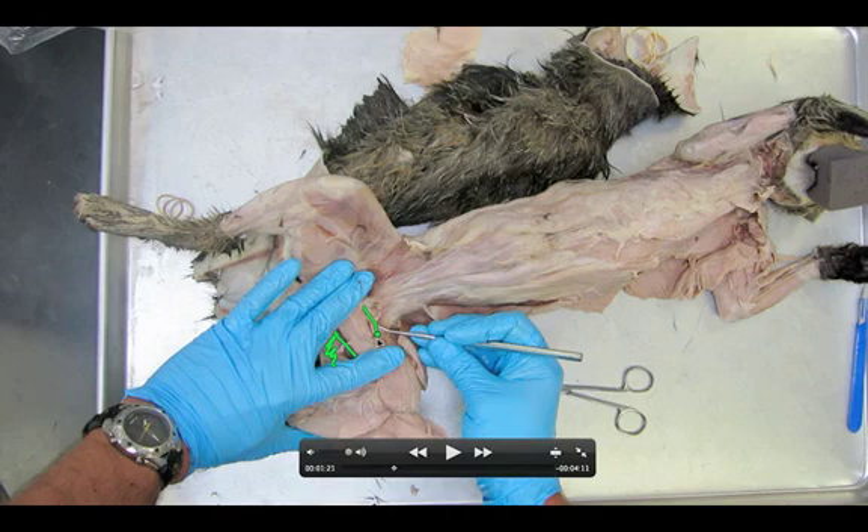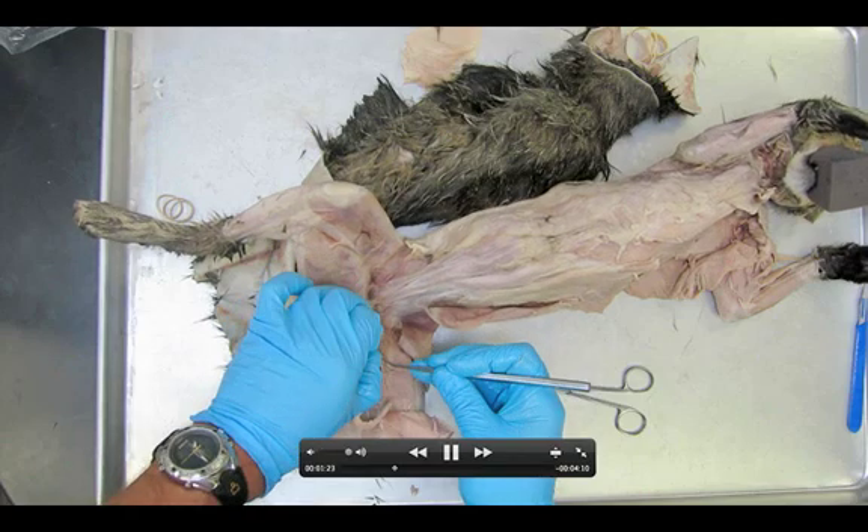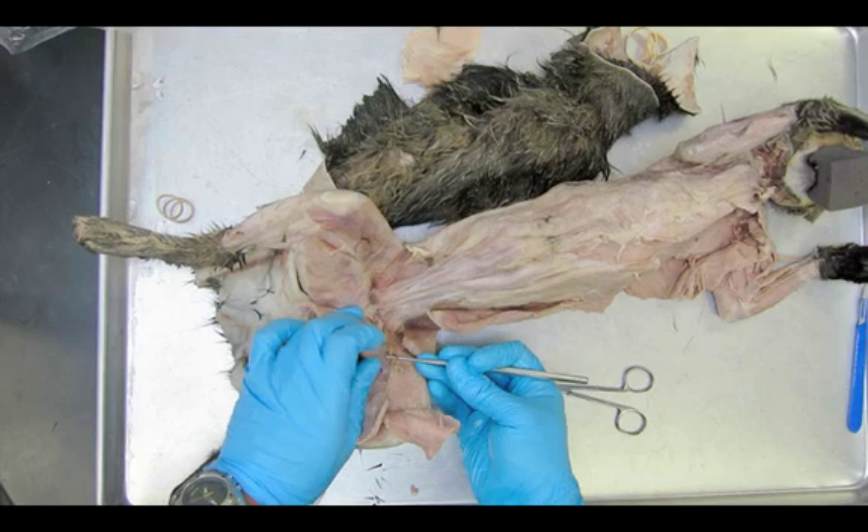So we have this muscle here — the semi-membranosus — the adductor femoris, adductor longus, and the pectineus, which will be even smaller. As you go through here you're going to notice a color change, which may be one of the most noticeable things: a deeper red color. These are more slow-twitch muscle fibers — those muscle fibers that have lots of mitochondria in them.